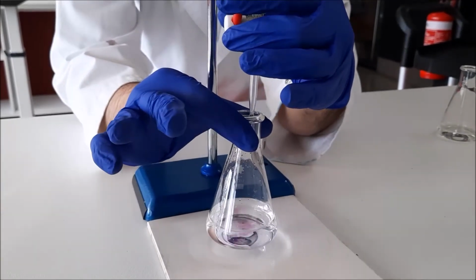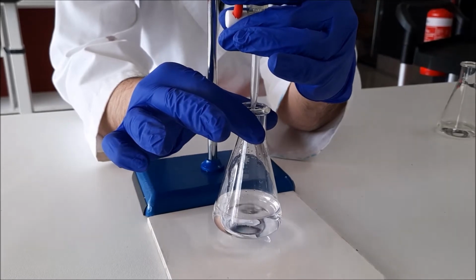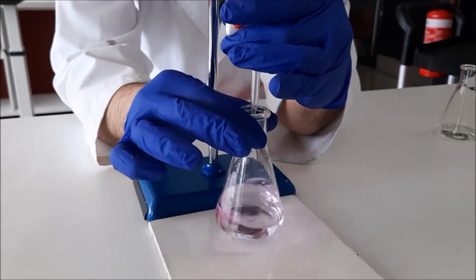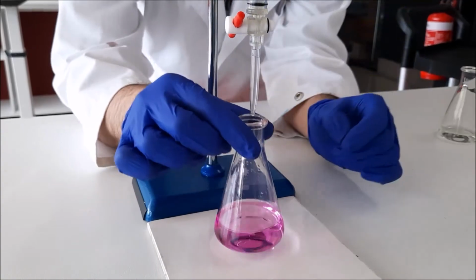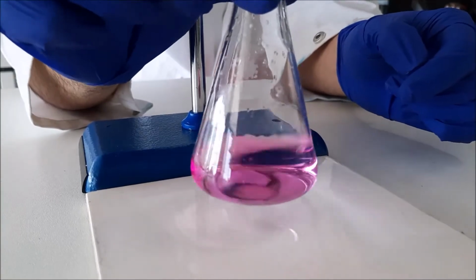You can see the pink color staying there, but as I swirl it, it disappears because it starts to even itself out through the whole solution. And there we have it. So you can see here it's a very light pink solution, so therefore we've reached our equivalence point.